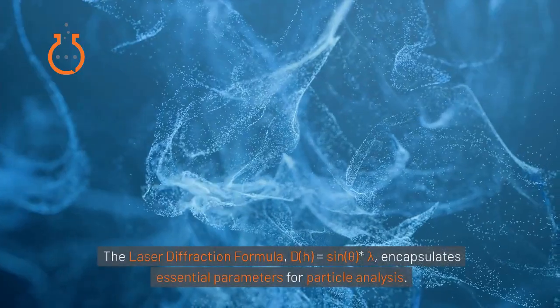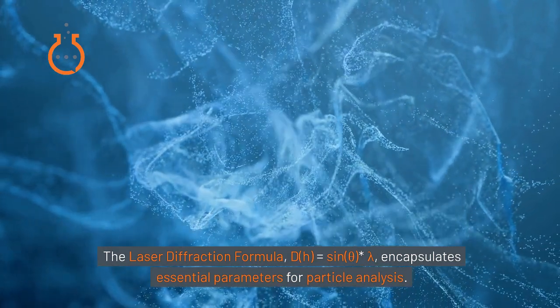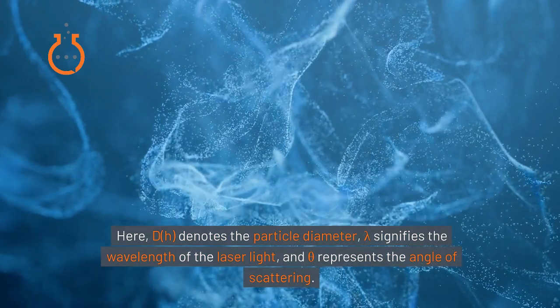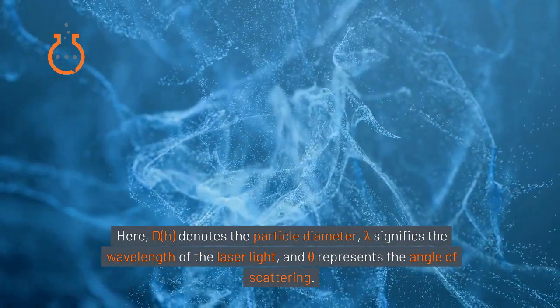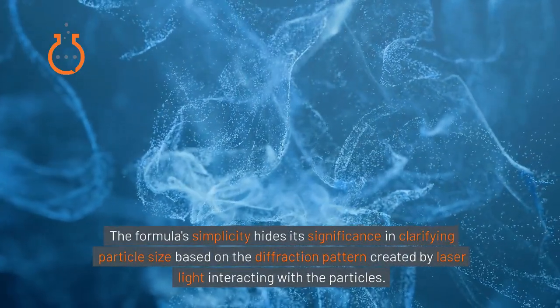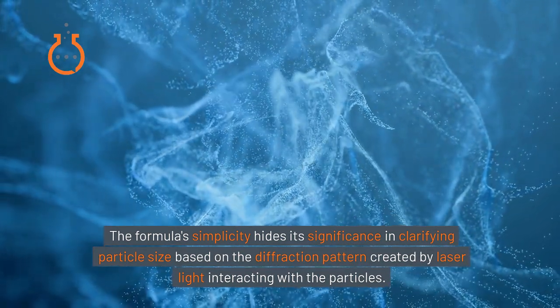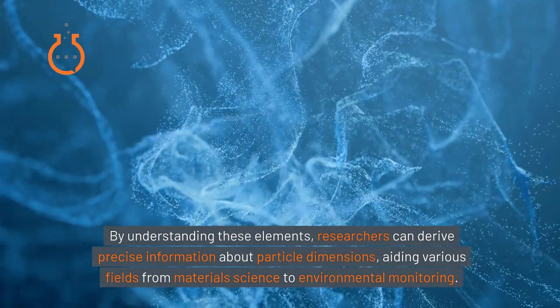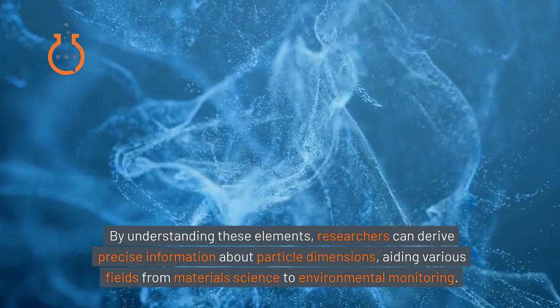The laser diffraction formula, dH equals sin(theta) times lambda, encapsulates essential parameters for particle analysis. Here, dH denotes the particle diameter, lambda signifies the wavelength of the laser light, and theta represents the angle of scattering. The formula's simplicity hides its significance in clarifying particle size based on the diffraction pattern created by laser light interacting with the particles. By understanding these elements, researchers can derive precise information about particle dimensions, aiding various fields from materials science to environmental monitoring.